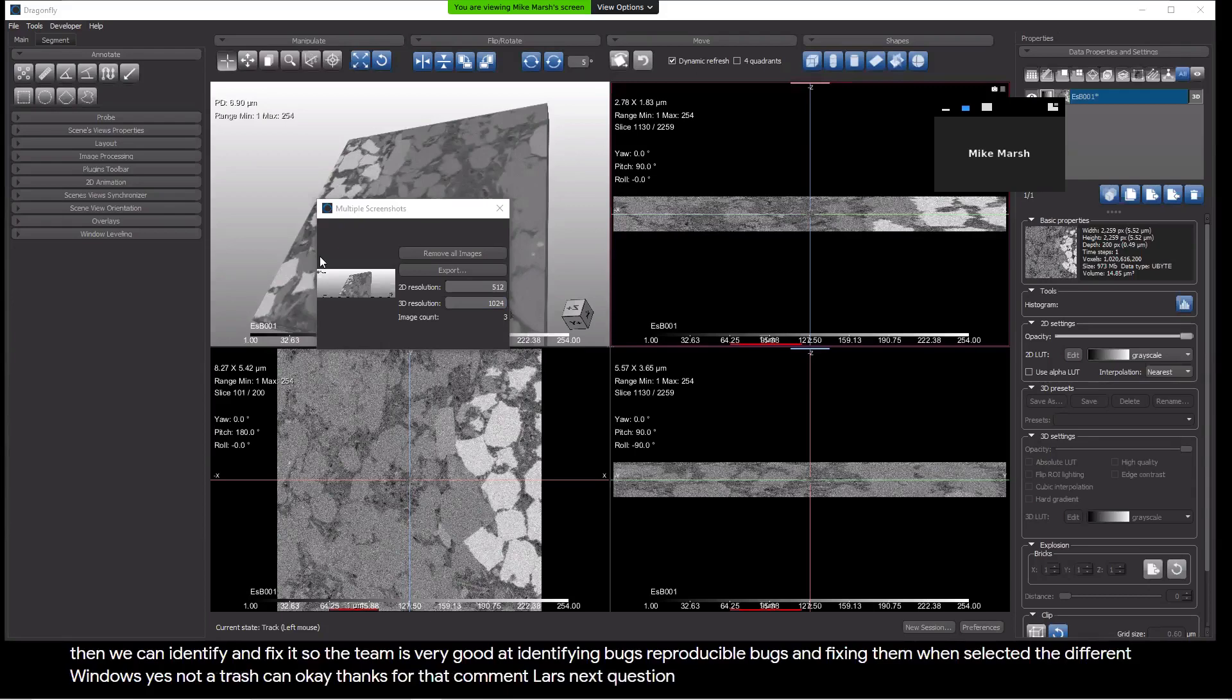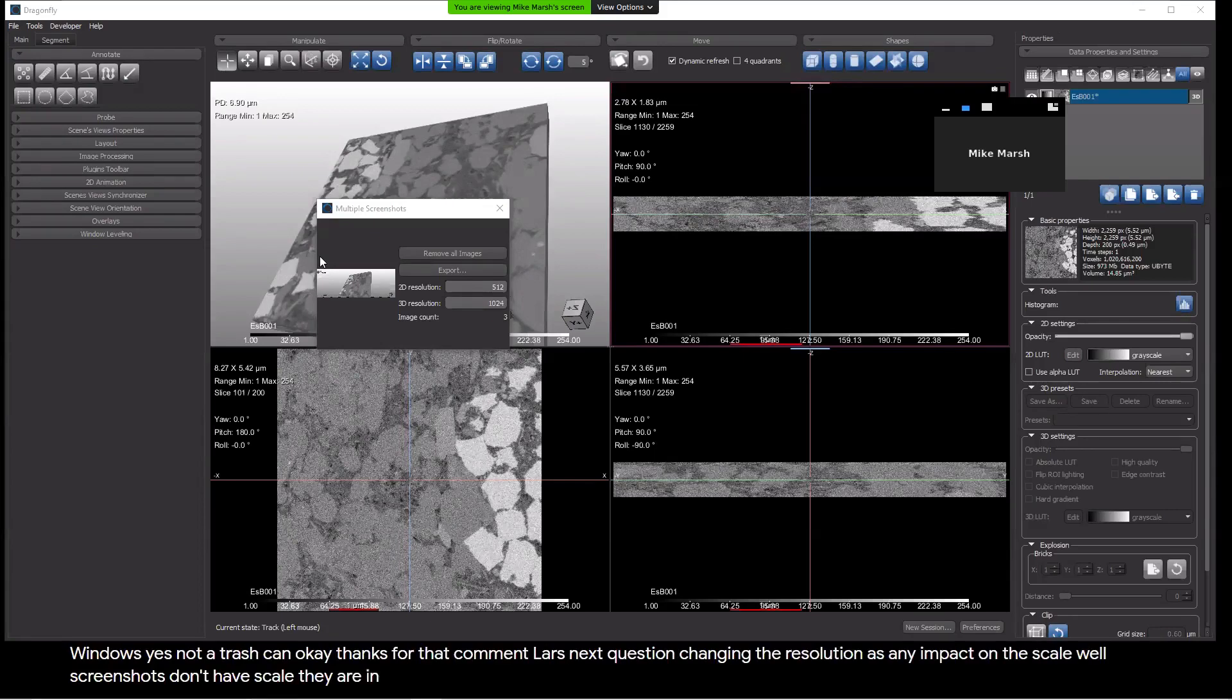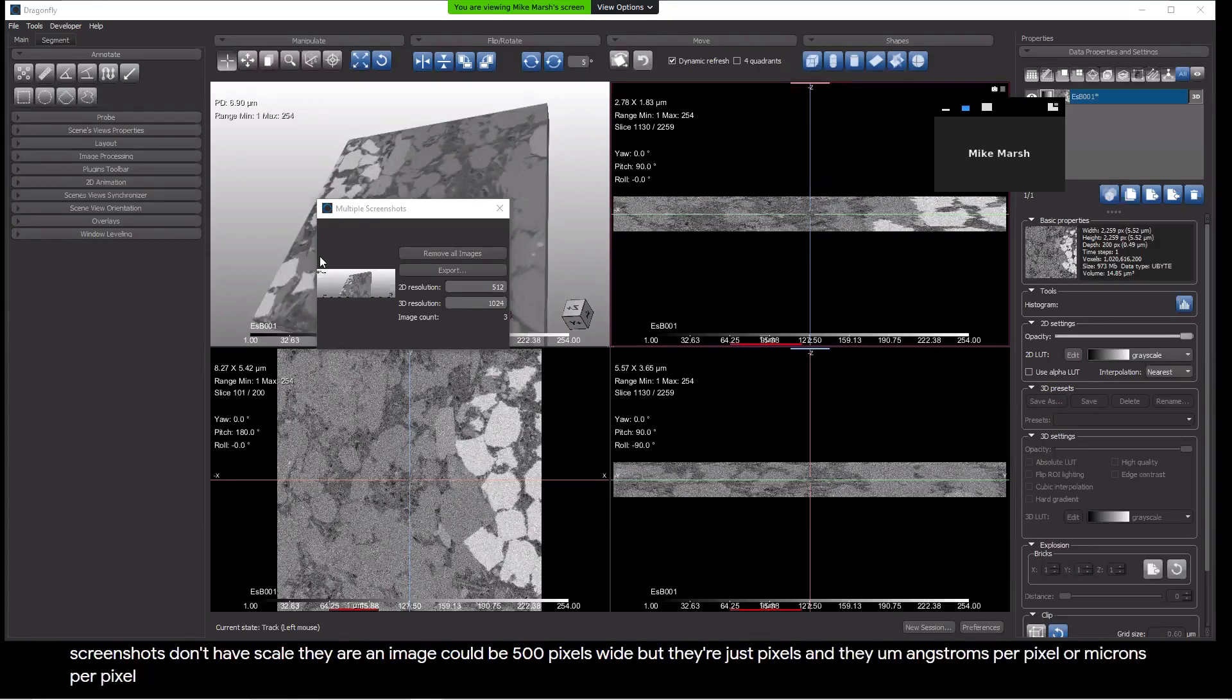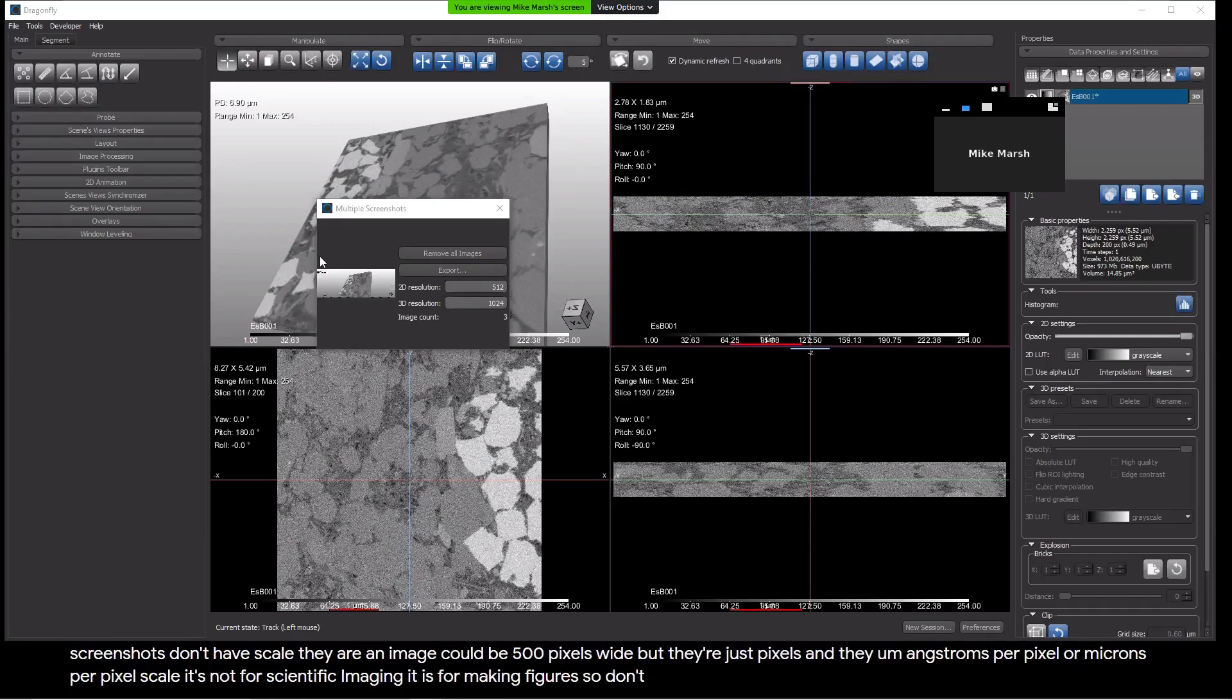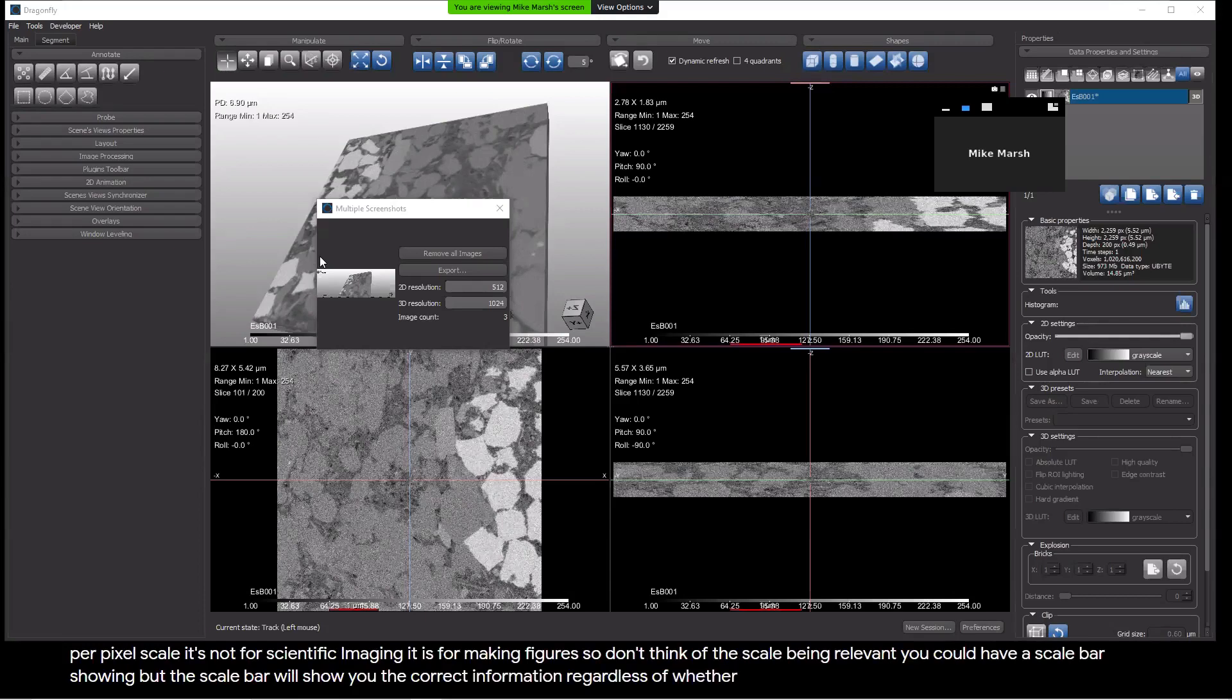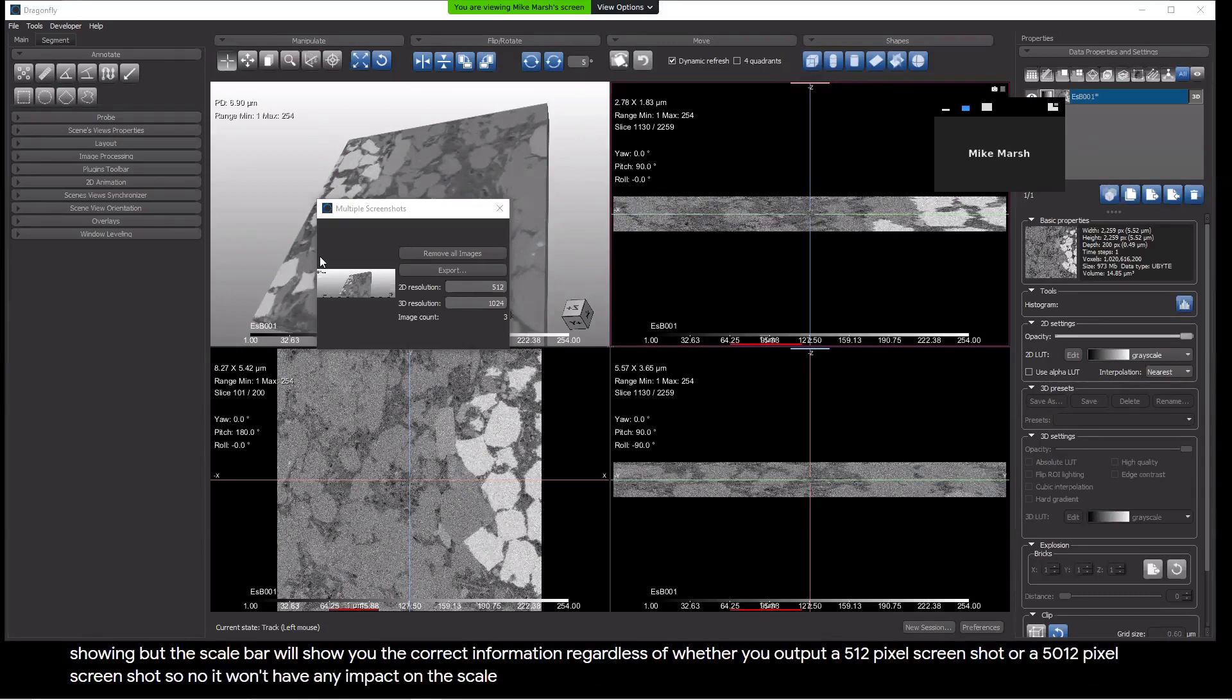Next question. Changing the resolution has any impact on the scale? Well, screenshots don't have scale. They are, an image could be 500 pixels wide, but they're just pixels, and they should not be interpreted as having angstroms per pixel or microns per pixel scale. It's not for scientific imaging. It is for making figures. So don't think of the scale being relevant. You could have a scale bar showing, but the scale bar will show you the correct information regardless of whether you output a 512 pixel screenshot or a 5,012 pixel screenshot.